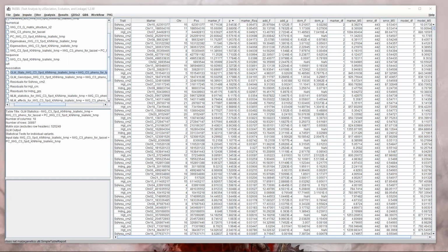And also, I guess, how do you look at your data and determine how confident you are in the imputation, especially if you have a very heterozygous, outcrossing crop? Yeah, so the data I'm showing you here was something that we'd already published.